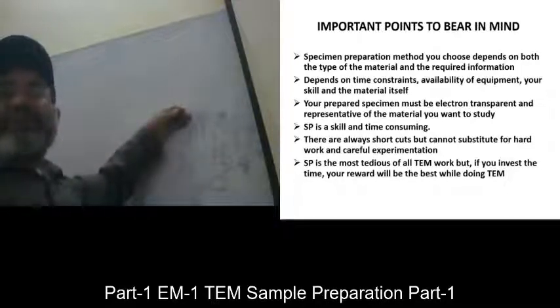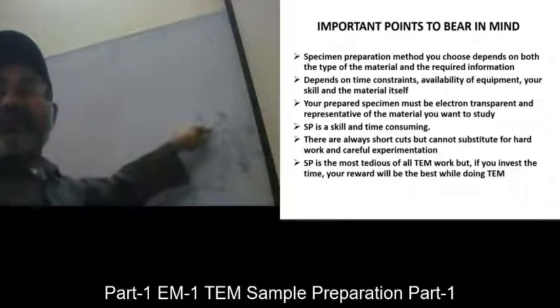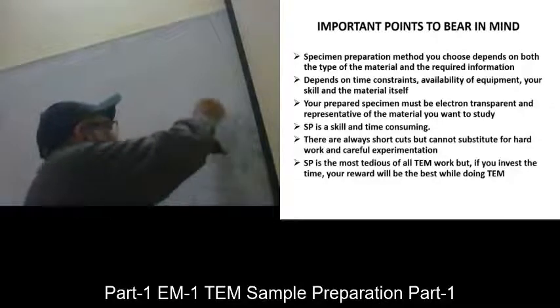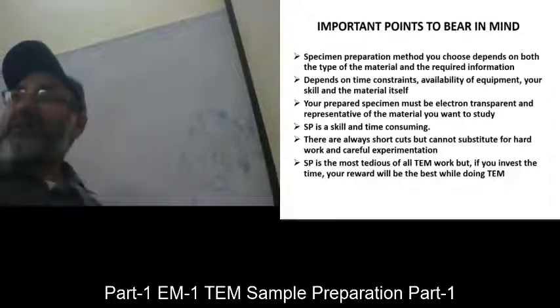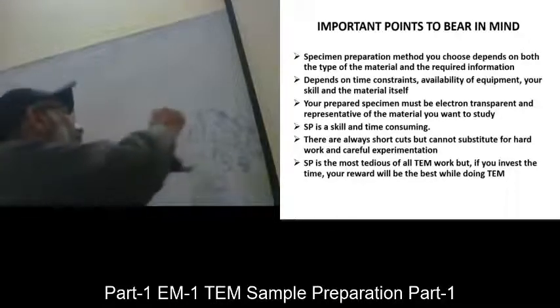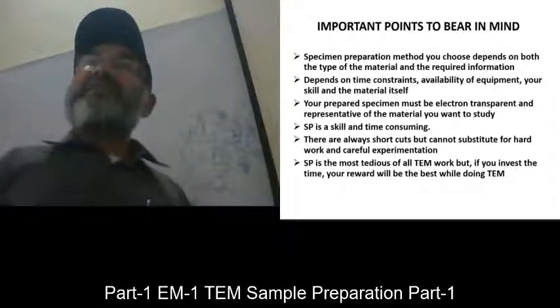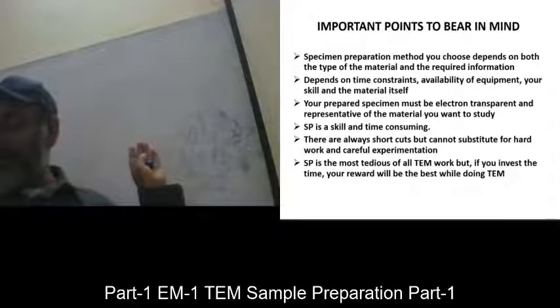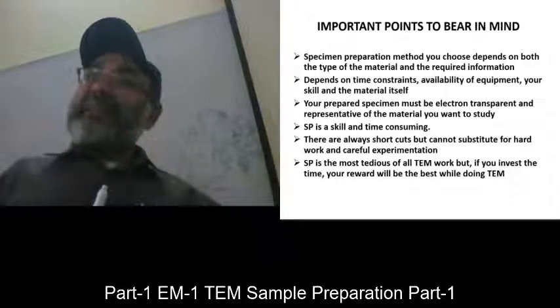If the crystal composition is this and the glassy composition is this, then for this crystal, if you are taking an EDS spectrum from this crystal, then the silicon and aluminum ratio should be 1:1, right? Al2, Si2. It should be 1:1. But if it is overlapped by the glass, and it, for example, appears as 2:3, and there is no such phase, then how will you defend your results? And for this purpose, you will have to rely on the other techniques.